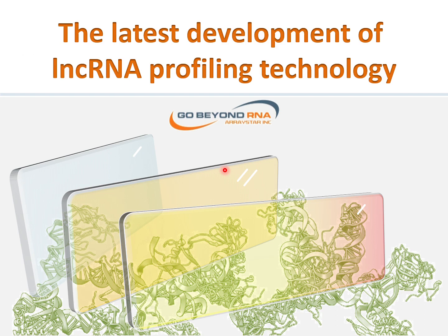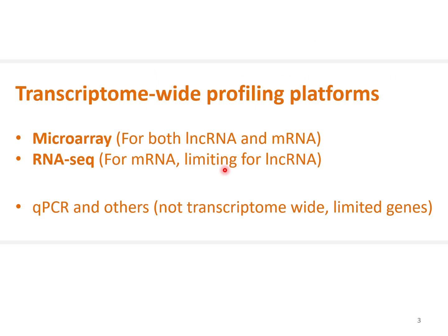Hello and welcome. In this video, we will talk about the recent LncRNA profiling technology development and what is the best way to profile the non-coding RNAs. Currently, there are two major technologies for transcriptome-wide profiling, namely microarray for both LncRNAs and mRNA, and RNA sequencing for mRNA. RNA sequencing has many limitations for LncRNA.